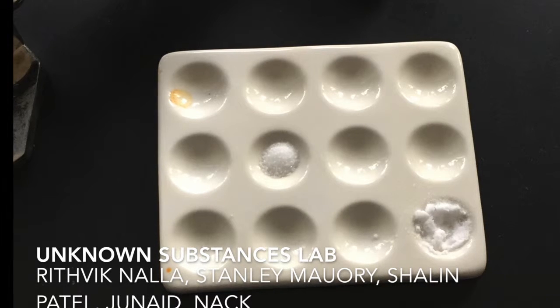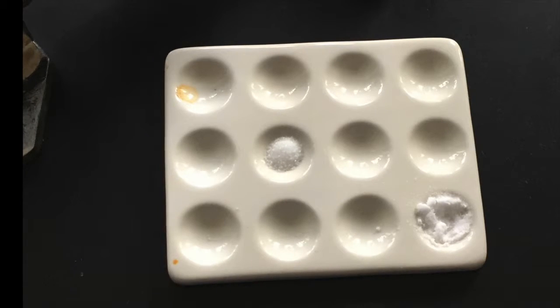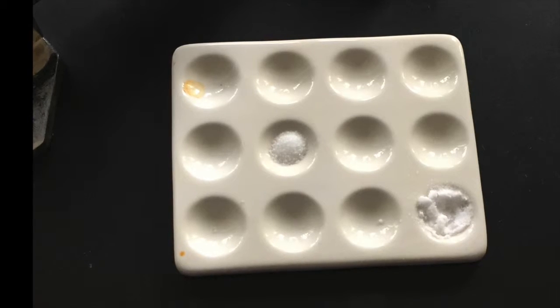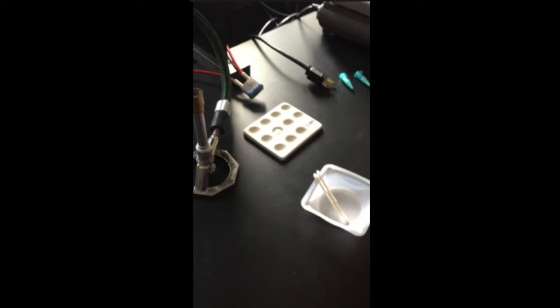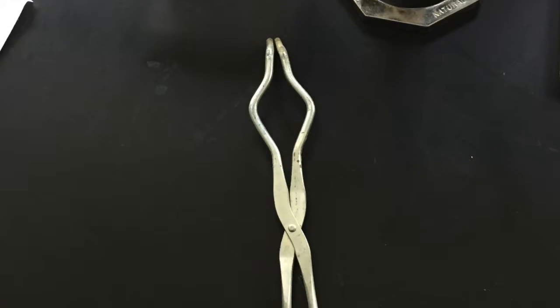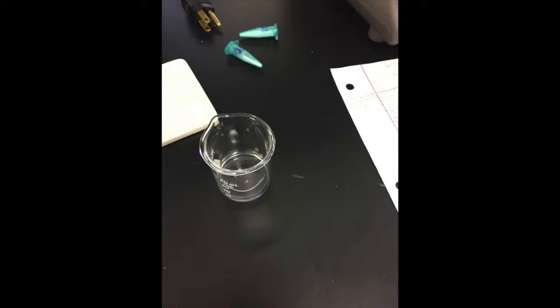Unknown Substances Lab. In this Unknown Substances Lab, we did many steps in order to narrow down our substances. First, we gathered all of our materials and information that we needed in order to complete the lab. After that, we had two unknown substances that we were given by Mr. Smith. These unknown substances were labeled Unknown Substance Number 21 and Unknown Substance Number 20. In order to find out the names of our unknown substances, we conducted an odor, color, solubility, and flame test.